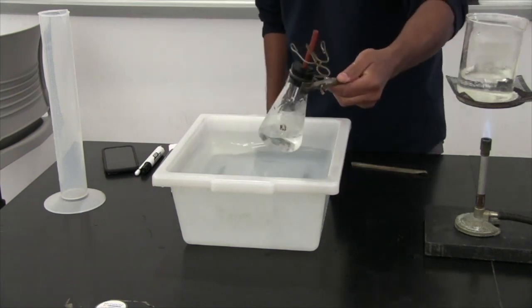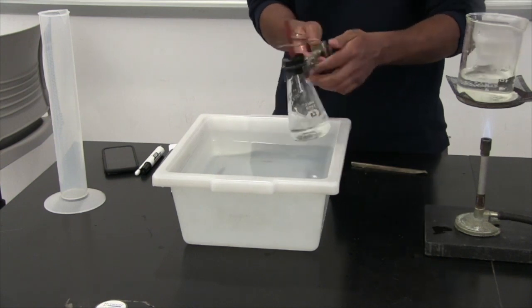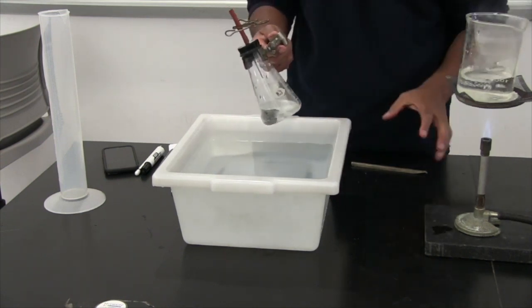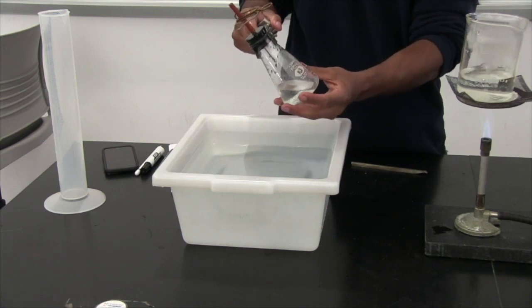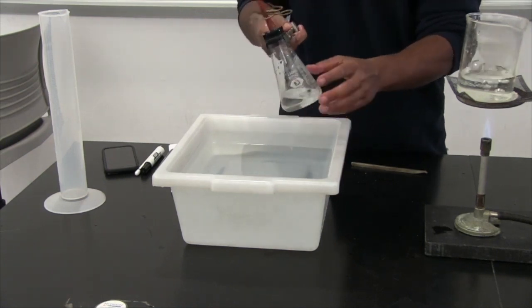And as you guys can see, some of the water went inside the flask. So I'm going to measure this volume for you guys, okay? And I'm also going to measure the volume of the original sample of air that was inside. And with this, we should be able to do our calculations.